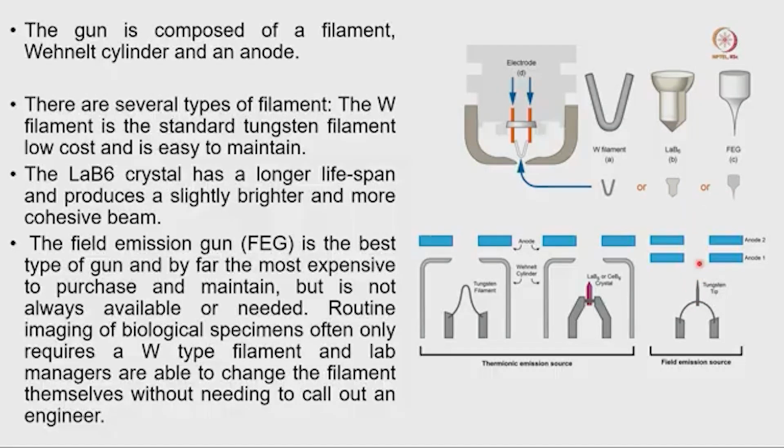So this is all about the electron gun, and in the next class we are going to discuss electromagnetic lenses, how these electromagnetic lenses help us to image.